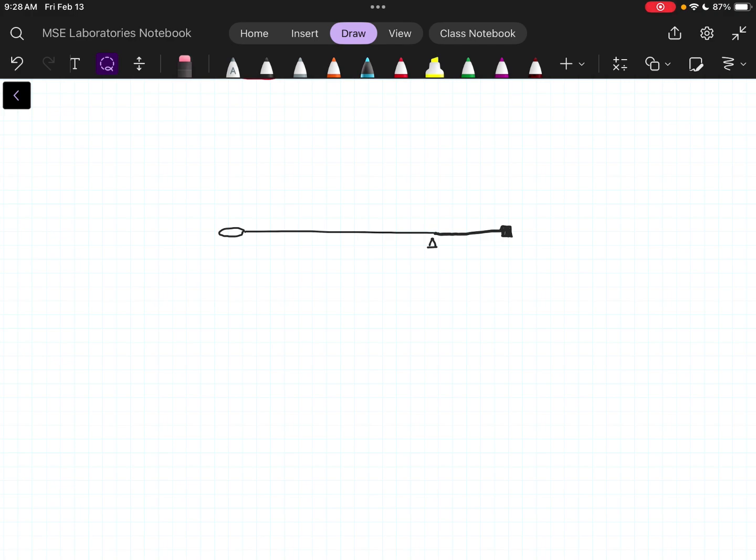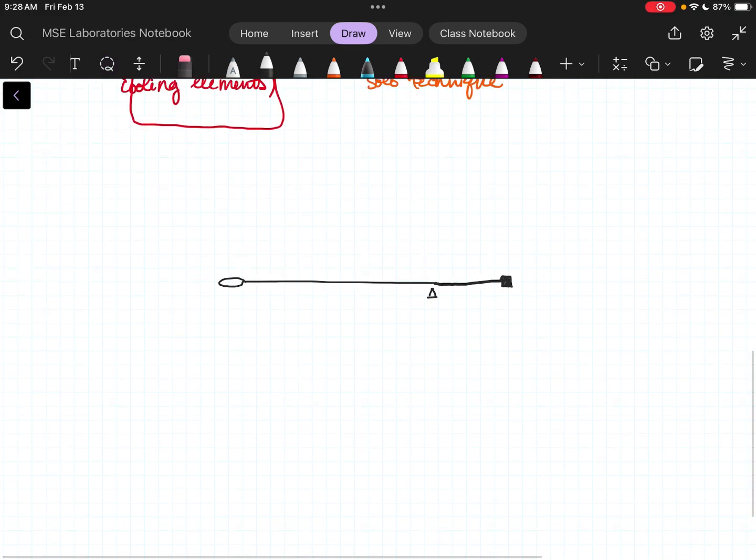And like I said, I maybe shouldn't put this under struggles, because when I talk about XRD or SEM, I don't talk about their ability to be hybridized with some other technique. I'm not saying this is a bad technique because I can't combine it with other things. The only reason we're doing that today is because, like I said, our instrument is a combo, and this is just going to help me justify a little bit why our setup is a little bit different.